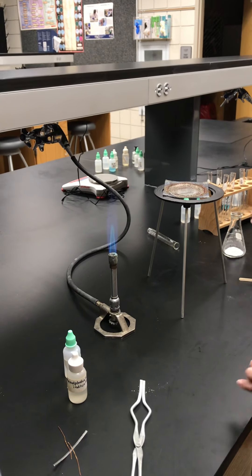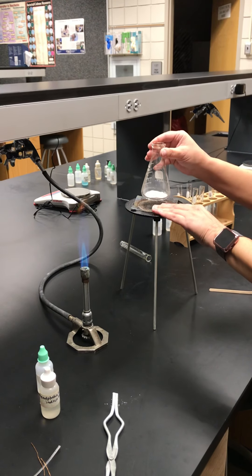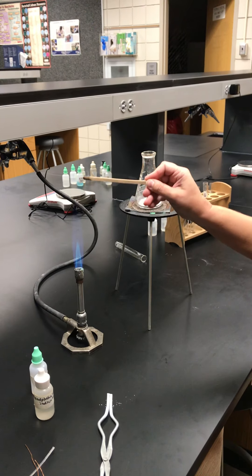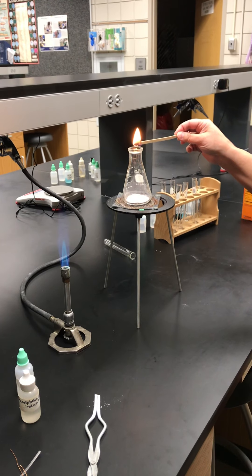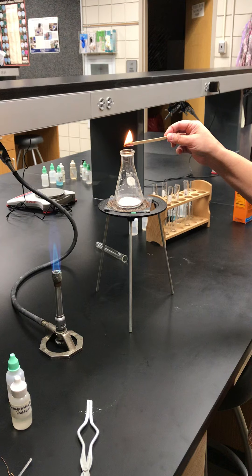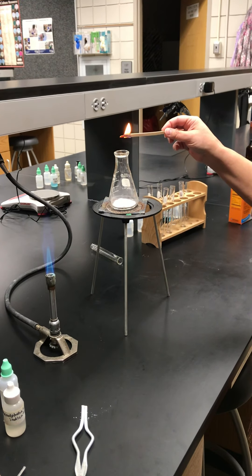The next thing they have you do is take some sodium bicarbonate and light the splint. You're going to hold it over the flask and notice that it burns — I could just leave this here and it would burn the entire splint out, so it would just keep burning.